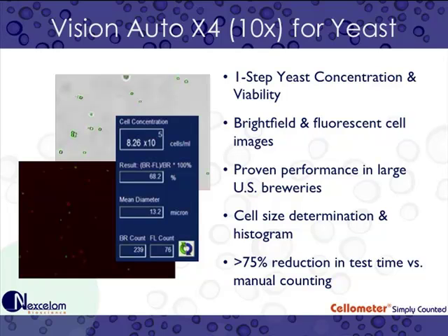After removing the disposable Cellometer cell counting chamber, the Auto X4 is ready to analyze the next sample.